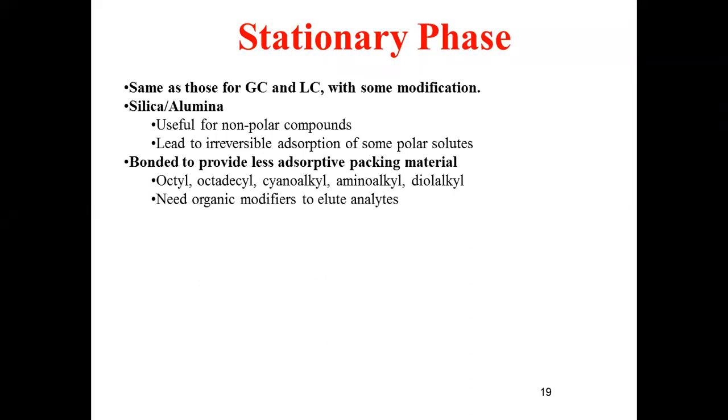As the polarity is suppressed, the physical adsorption can be suppressed, and hence the band broadening from channeling can be reduced. And this bonded silica can also be mixed with organic modifiers in order to adjust the retention time and the capacity factor, and thereby the overall resolution can be enhanced.